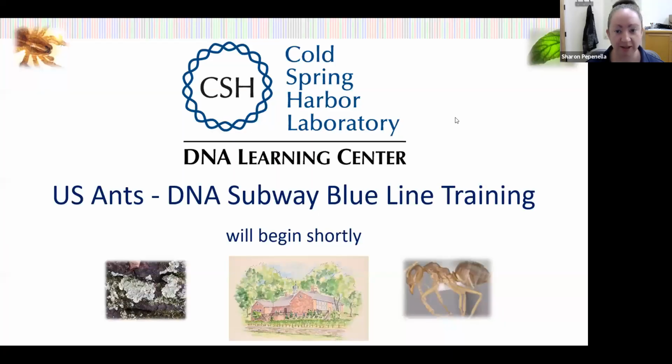We'll start here with my slides. So as I mentioned, we're going to be doing a training using DNA Subway's blue line today. If you're not sure what that means, we'll talk about that again in just a little bit. But DNA Subway is our bioinformatics tool that's going to allow you to analyze your ant sequence data.